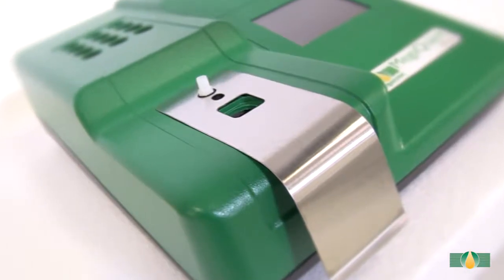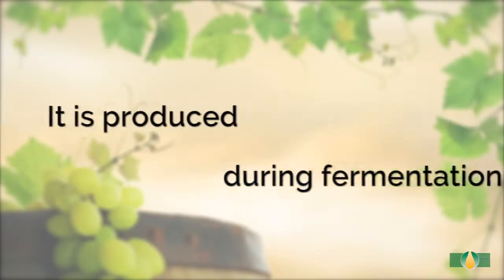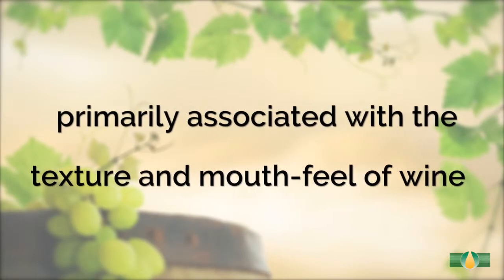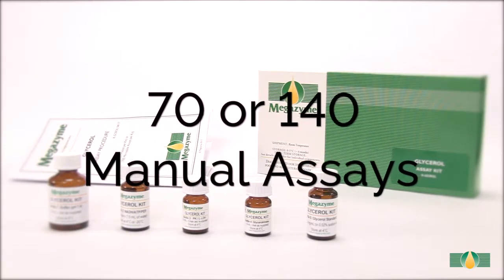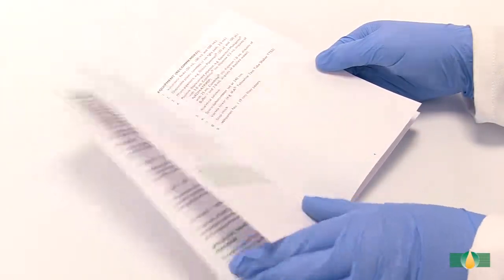spectrophotometer format. It is important to measure glycerol in wine as it is produced during fermentation and is primarily associated with the texture and mouthfeel of wine. This kit contains sufficient reagents for either 70 or 140 manual assays and is supplied with a detailed data booklet.